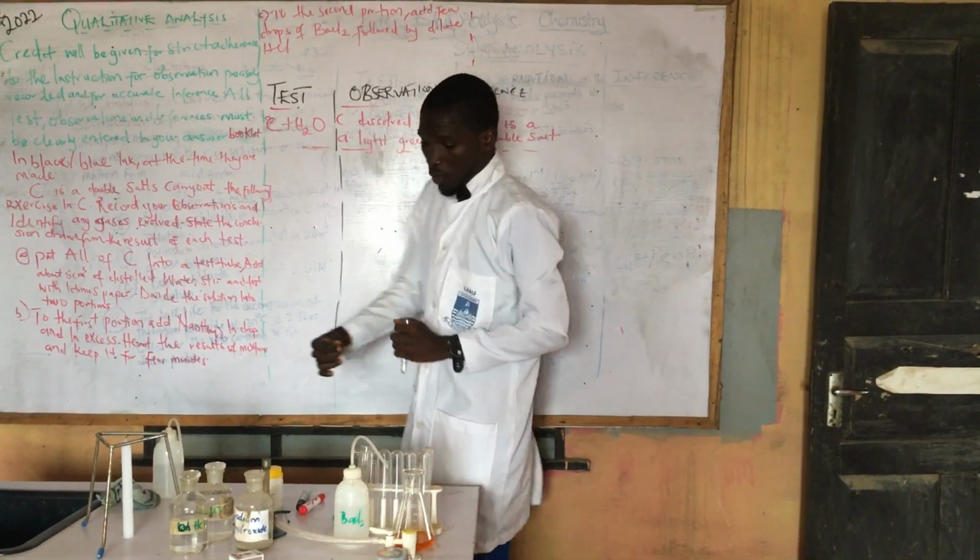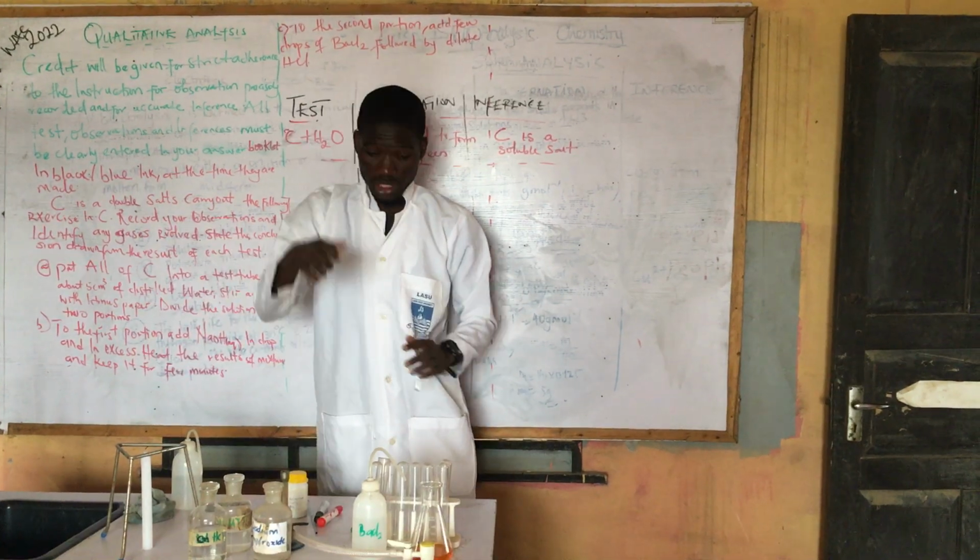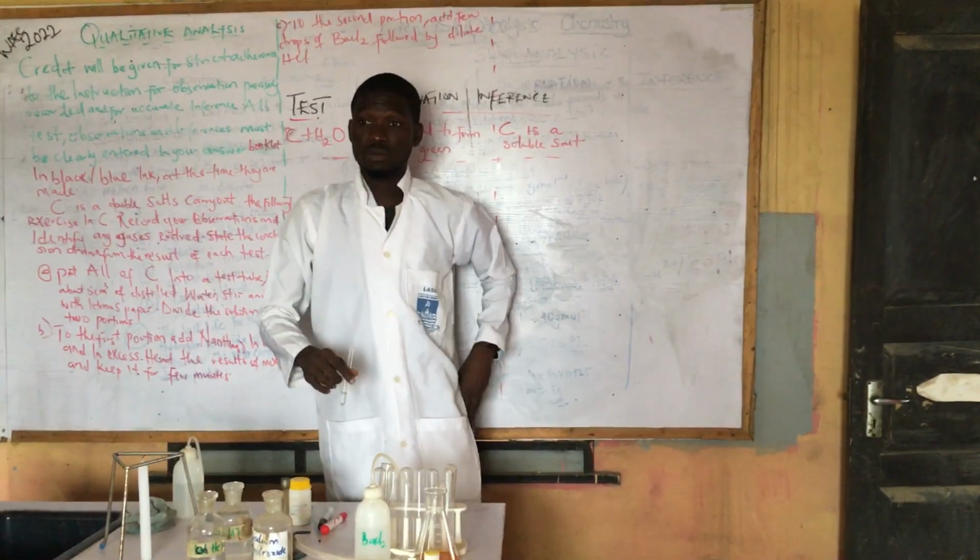So now, please get me the litmus paper. The litmus paper, please.